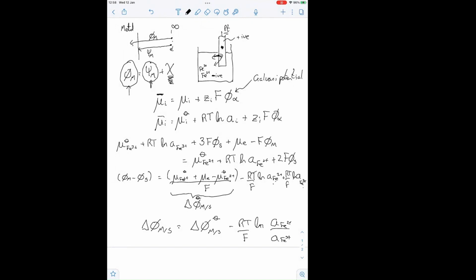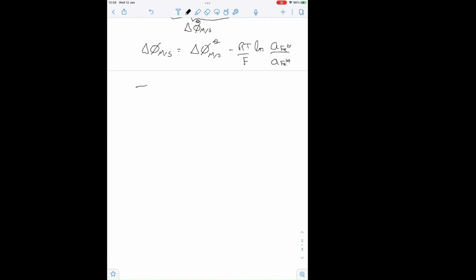measure that potential. To measure a potential, or what's sometimes called an electromotive force, I need to put a second interface in there and a voltmeter. So if I put a voltmeter here to measure the voltage, well, where do I put the other side of the voltmeter? I've got to put another interface in there. So whenever I'm doing a measurement of just a potential, I actually have two interfaces. Okay? So I have a potential drop here and a potential drop here.